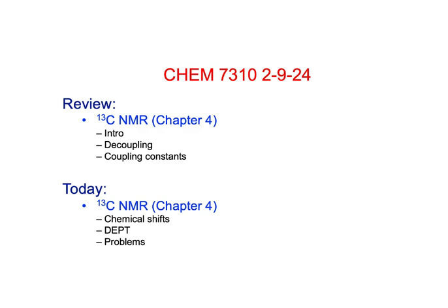Okay, so I think today we're going to be able to finish up most of our C13 NMR. So we have been going through C13. We spent a lot of time talking about decoupling and pulse sequences and coupling constants. We've started talking about chemical shifts, so we're kind of in that right now. We've got just a little bit more to look at there. Then we're going to work a few problems. And then we're going to talk about one other experiment. Maybe you know this DEPT experiment.